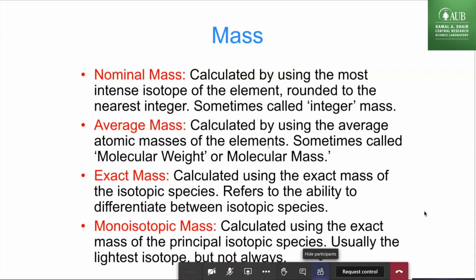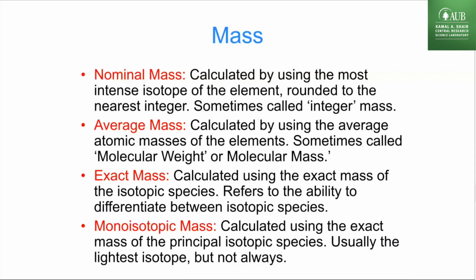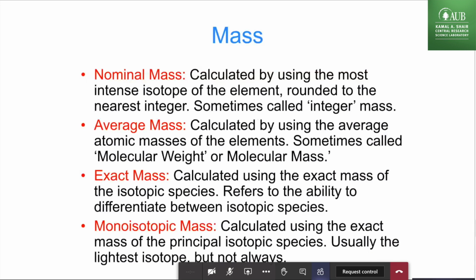So, you know, when you buy a standard, for example, the triazines, and you look on the package, especially if it comes from Sigma Aldrich or something like that, do you know which of these masses it says on the package? Has anybody bought a standard in their work and looked on the package to see what mass is there?